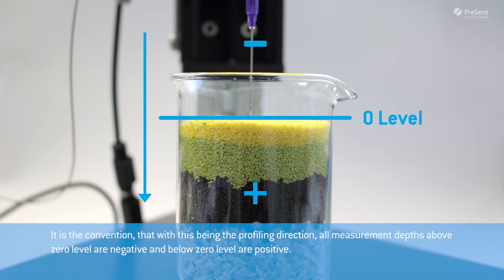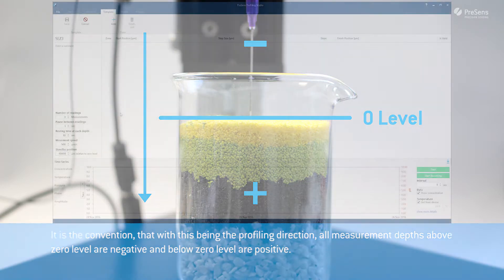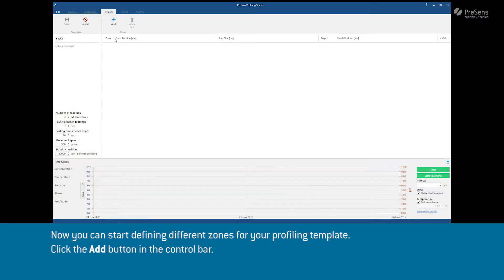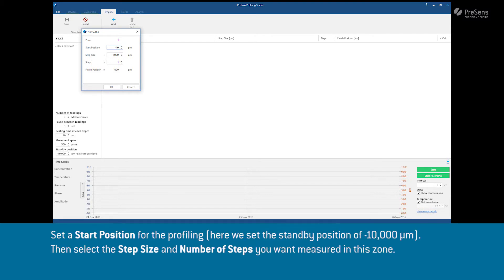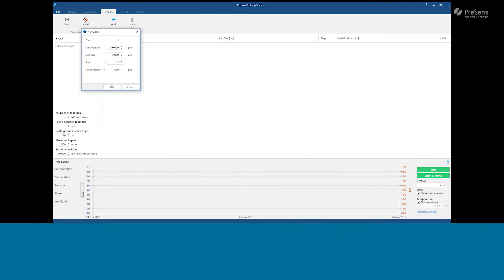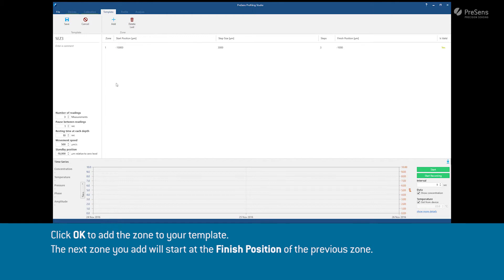Now you can start defining zones for your profiling template. Click the Add button in the control bar. Set a start position for the profiling. Here we set a standby position of minus 10,000 micrometers. Then select the step size and number of steps you want to measure in this zone. Click OK to add the zone to your template.